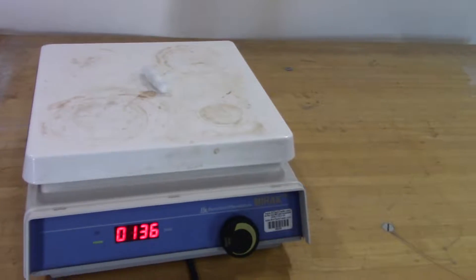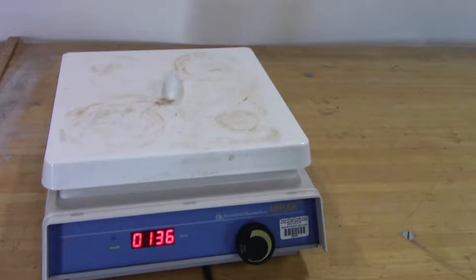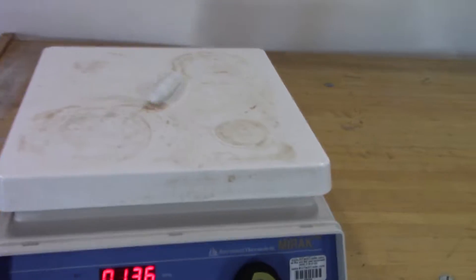Hi, this is Michael from iTechTrader. Today we're looking at a Mirac stir. As you can see, we've got it rotating at 136 RPM.